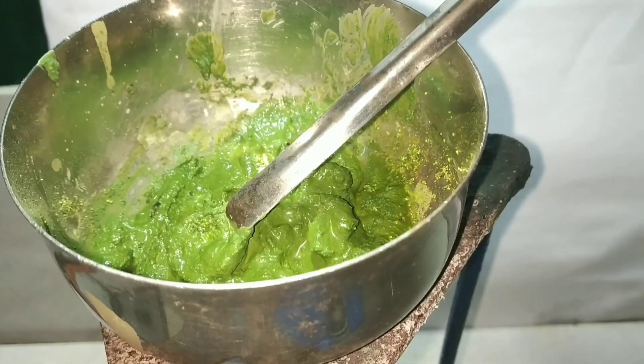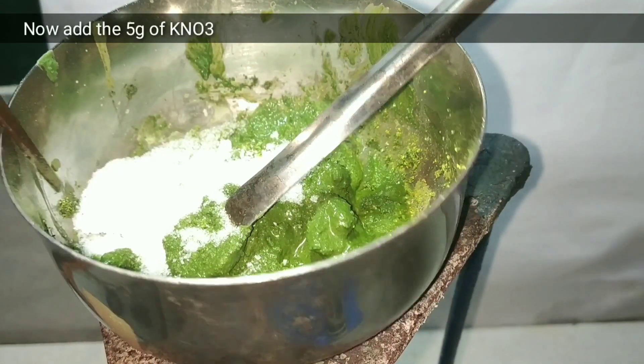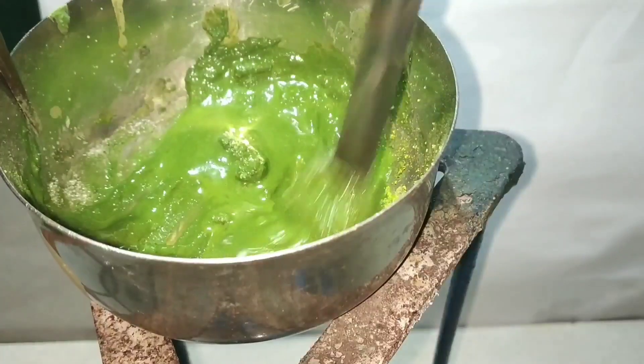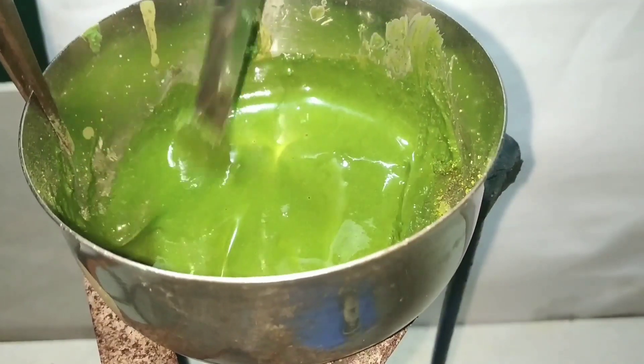When everything turns into a thin paste, add the 5 grams of potassium nitrate into it and mix everything up well. Now you can see the green color of chromic oxide. We have to continue heating for 20 minutes.